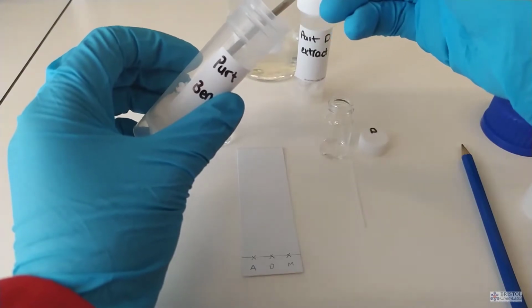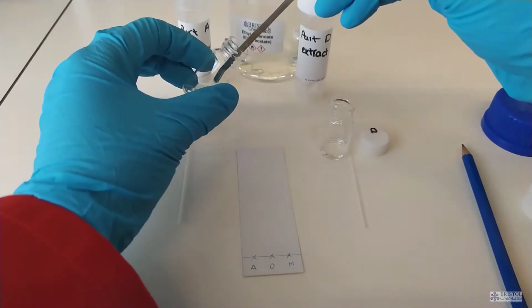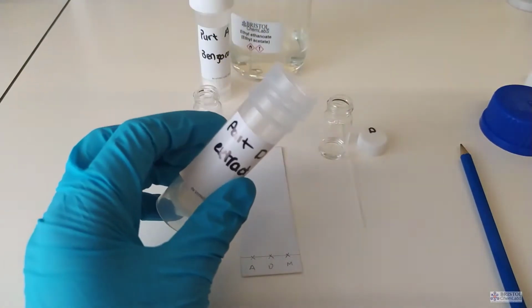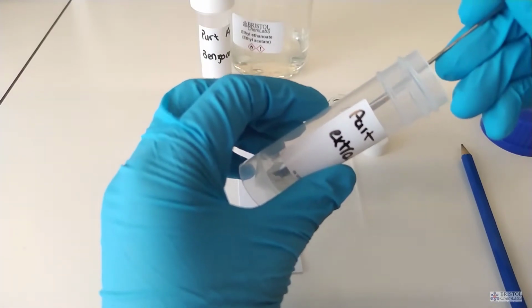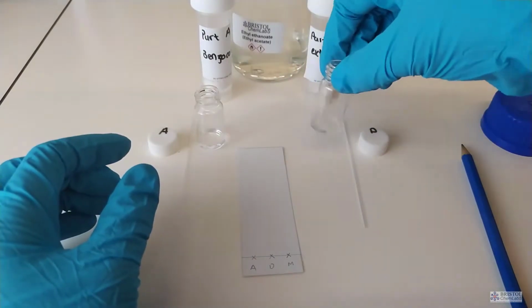Make up some solutions of the samples under test. Here we're going to make a solution of pure benzocaine and the benzocaine produced in the reaction. We dissolve up small amounts of our sample into an appropriate solvent, such as ethyl ethanoate.